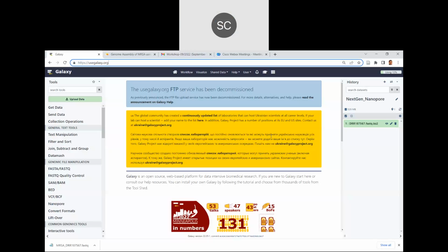A Word file is not readable by programs. What kind of sequence? mRNA, RNA, DNA, protein, can we give anything? That depends on the analysis that you want to do. If you're doing an RNA analysis, the pipeline will be very different because the tools that you're going to use are going to be different. At the base of it, what you're doing is uploading a FASTQ file. I told you the format of a FASTQ file, right?